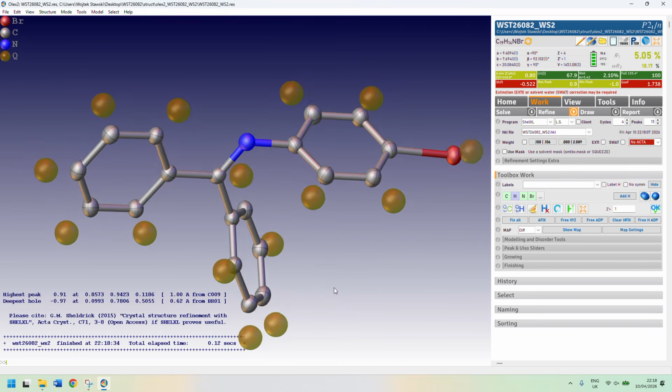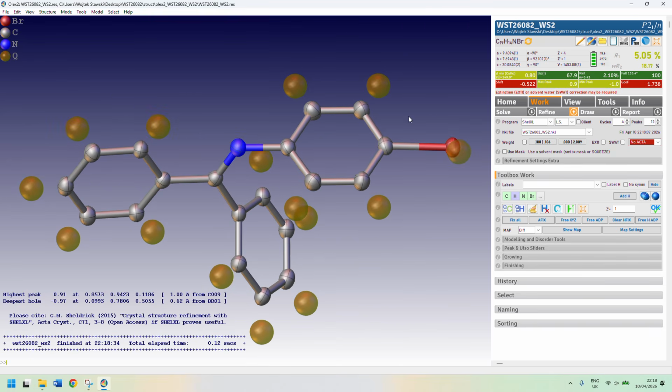Okay, and we can do hadd to add hydrogen atoms, or another way to do that is to go to here, add hydrogens. But I always try to use the command set. Command set is much faster. Okay, Ctrl R.